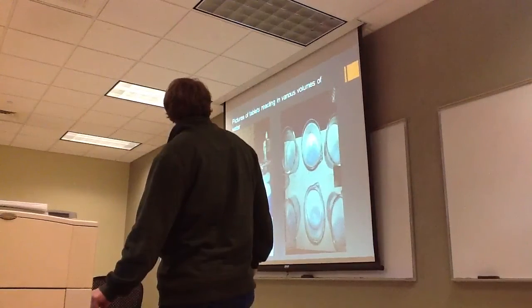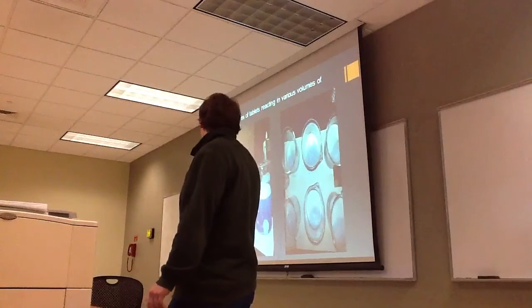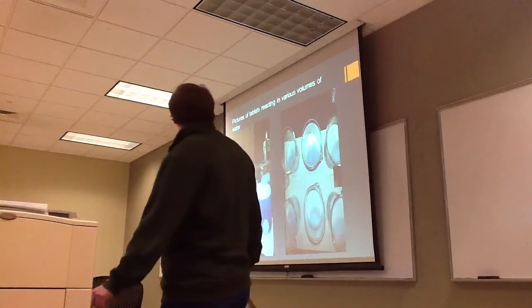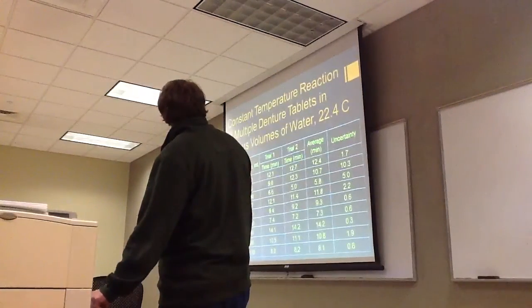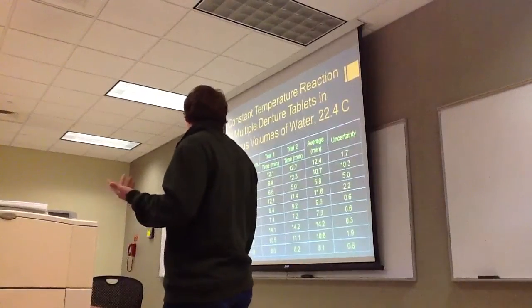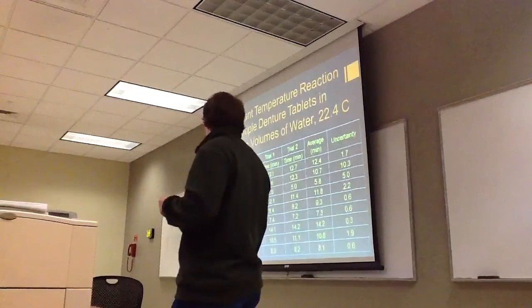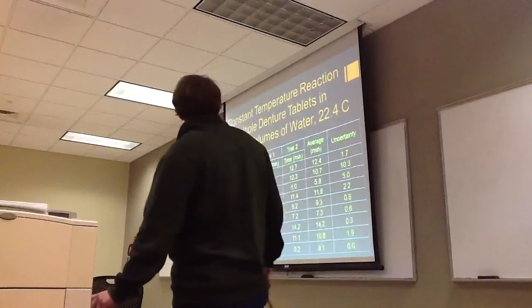Here are some pictures of the reactions that we did, showing the decomposition of the denture tablets in the water and the color change. Here's another experiment we did with multiple quantities of tablets. We did 1, 2, and 3 tablets to see what effect that would have. We also varied the volume of water as before.